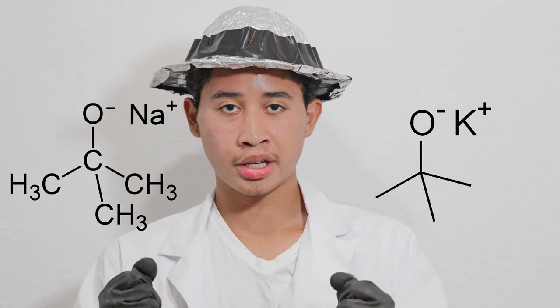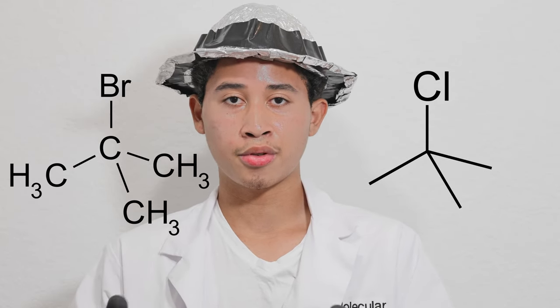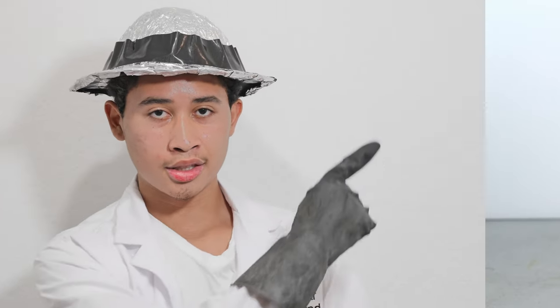The reason why I'm making tert-butanol is that it is an incredibly versatile reagent. It can react with alkali metals like sodium and potassium to form very strong bulky bases known as tert-butoxides. It can also react with hydrogen halides to form tert-butyl halides. With sulfuric acid, it can dehydrate into isobutylene. And with aromatic compounds, it can add on to them as tert-butyl substituents. But that's enough about tert-butanol. Let's get started.